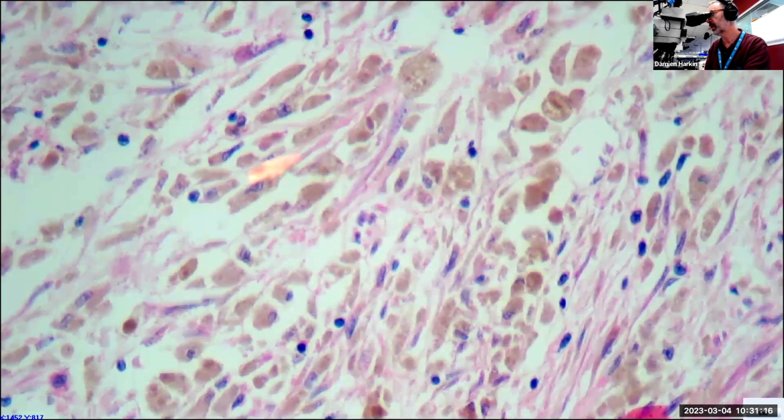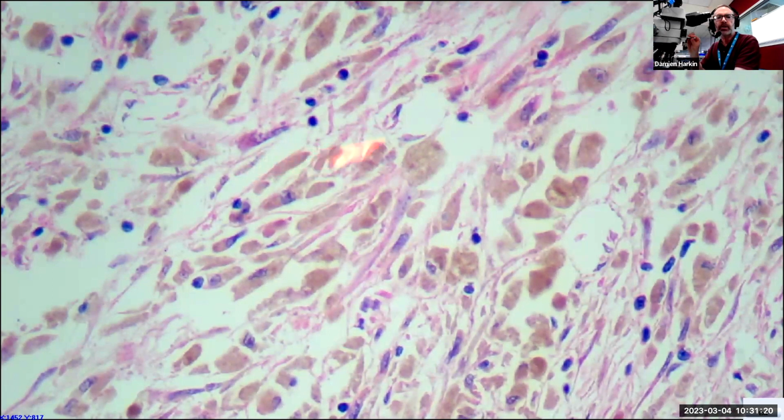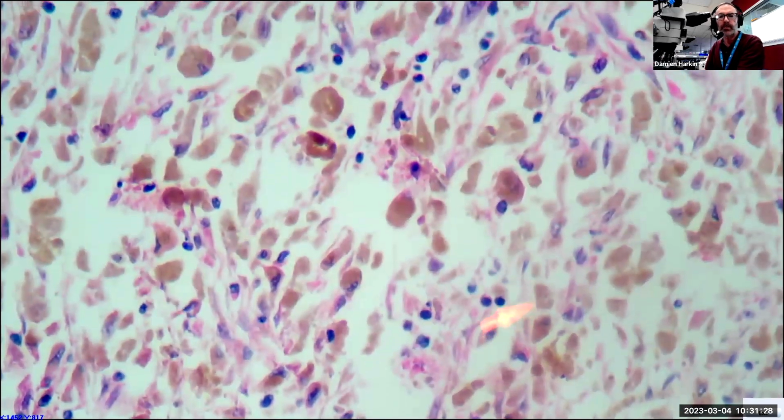Let's just have a look here. Okay, so we've got sort of partial bleaching. I think so, you can sort of see that there. So there is certainly some removal, but it is not actually as complete as you would hope for.